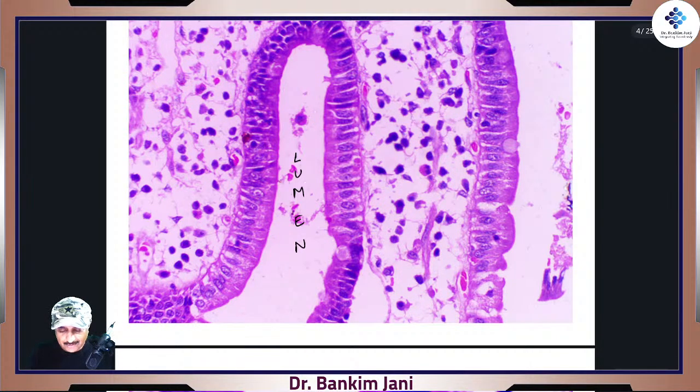So see, such beautiful large elongated nuclei, right? This one, this one, this one, all are classical examples, right? And then there is so much cytoplasm, because if we really draw one complete cell, these are like this, and here, this is all cytoplasm, right? And see how nicely even the individual cells can be seen. How nice if we zoom it further, right?